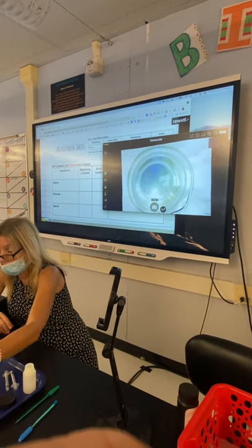So on our ending location: iodine is still in the beaker — the beaker is still yellow — but it's also in the bag now. Glucose: we put it in the bag and the bag hasn't changed much, so I'm betting there's still glucose in there. Our question is, we know glucose is in the bag at the ending location, but we want to know if it's also in the beaker. So we'll test it. Put a pin in that for a second — let's jump down to starch.